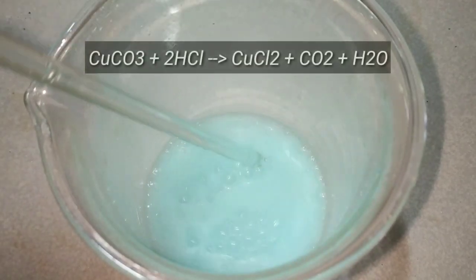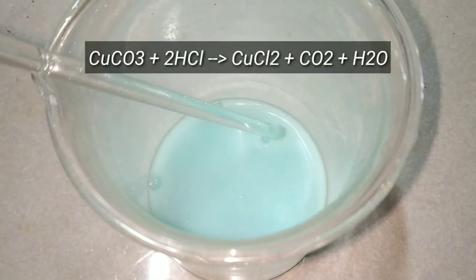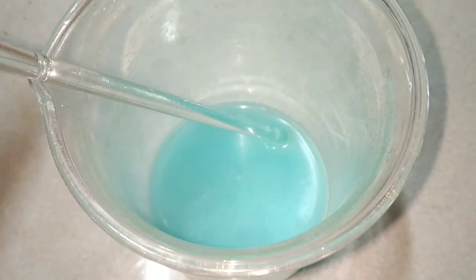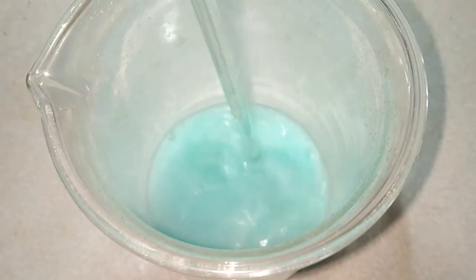What's happening here is copper carbonate reacts with two molecules of hydrochloric acid to form copper 2 chloride, carbon dioxide gas, and water.